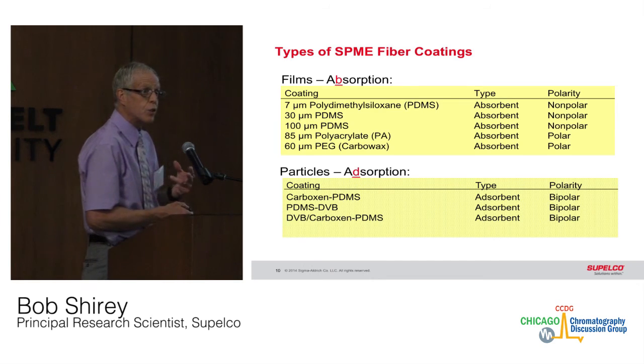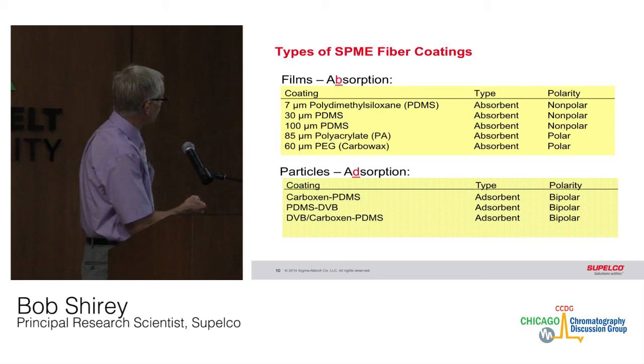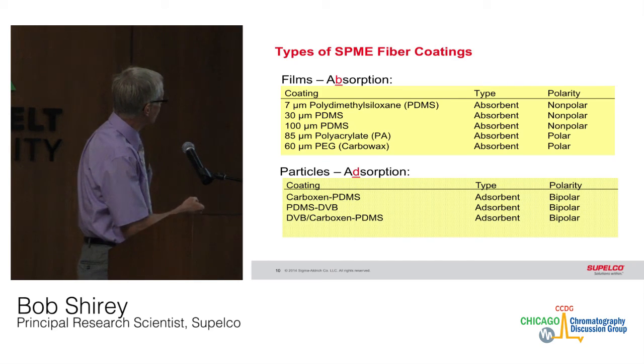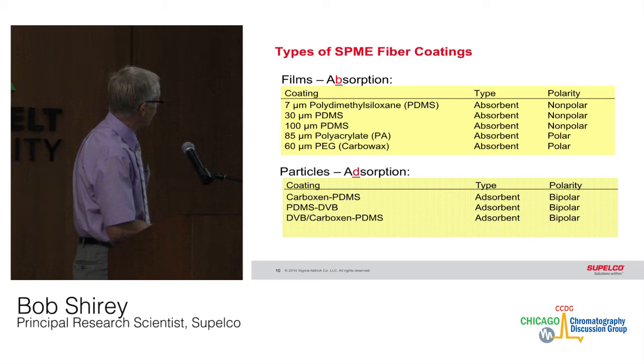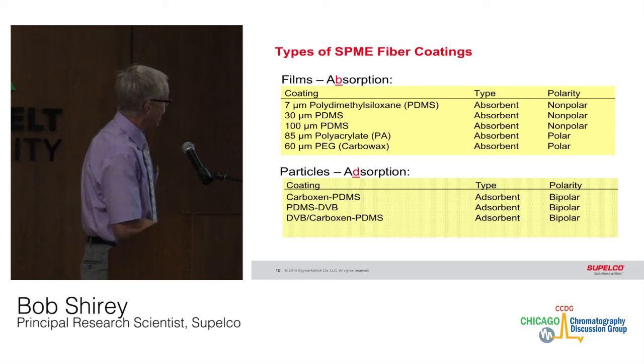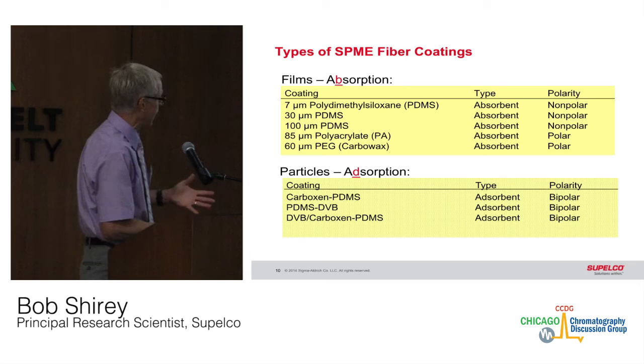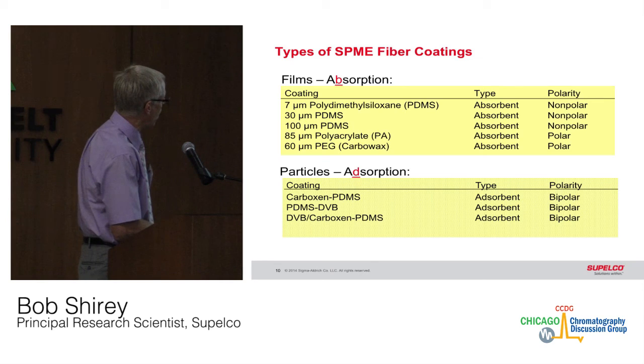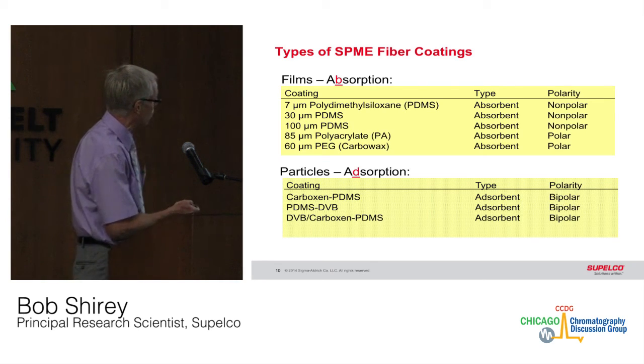Small volatile compounds, which move much faster, need a thicker coating to retain them, whereas large analytes are not going to desorb very well off of a thicker coating. As you can see, there are a couple of polar coatings for this. As far as adsorption goes, you can look at Carboxen and divinylbenzene as adsorbents. And we call these bipolar because once the analyte gets into those pores, it's primarily retained. And we have one combination fiber, which I will talk about in more detail later.